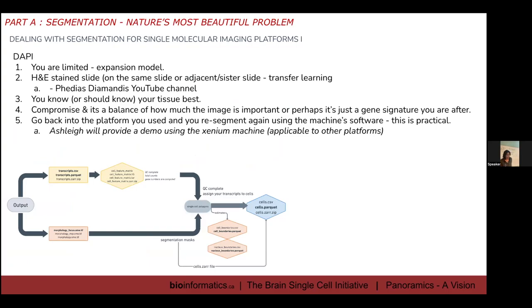Today, we won't go through CellPose or Mesmer specifically because there are too many and they all have well-engineered tutorials. Instead, we're going to compare the Xenium segmentation output — you'll overlay it over the images I've subsetted, look at the boundaries, overlay a subset of transcripts, and compare it with the BASOR segmentation model. Then at the end we'll look at the segmentation-free method, because it's not just about doing segmentation and getting the mask — it's about what you do after that.